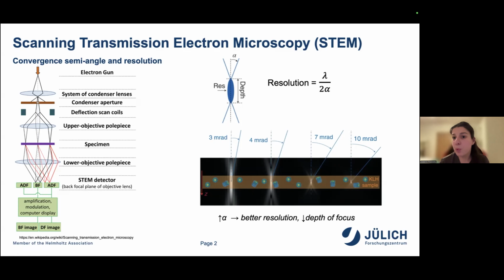But an important parameter to form our probe and its geometry is the convergence semi-angle, the alpha that you can see here. With that, we are able to fix the depth of focus, and also it's related with the maximal theoretical resolution that we can reach. As we are opening our convergence semi-angle, our probe, we are decreasing the depth of focus, and then we can reach higher resolutions.